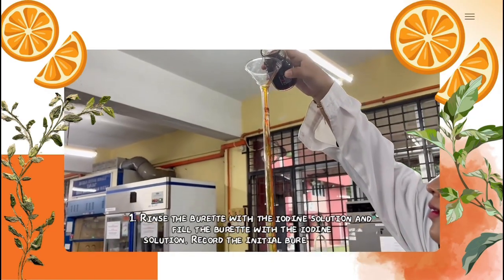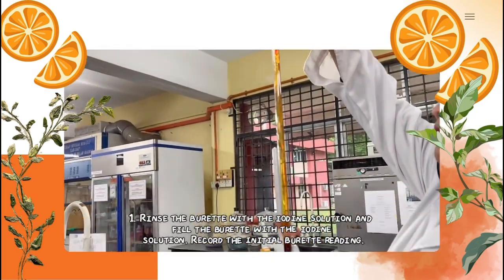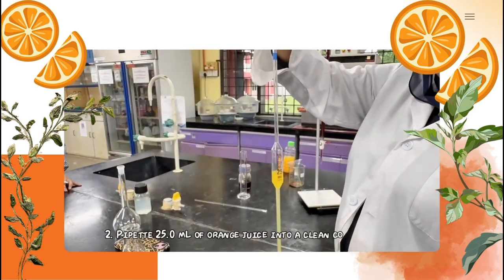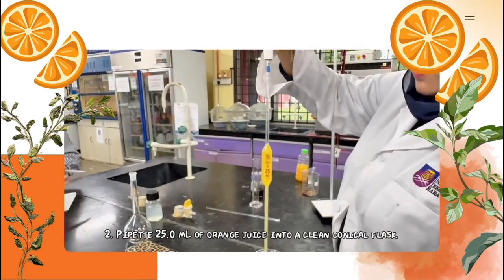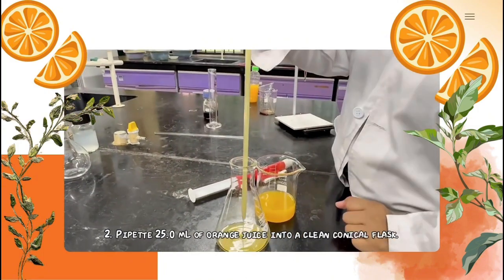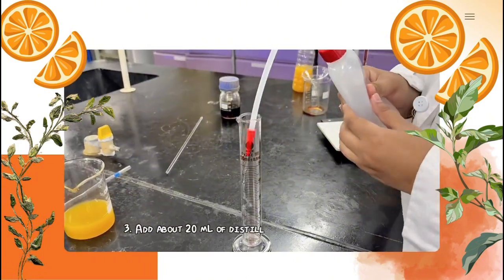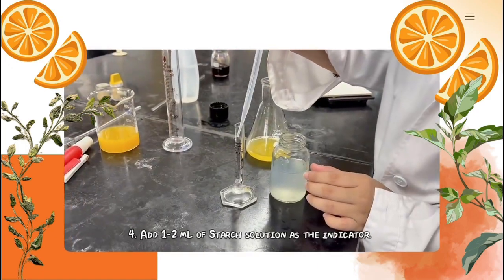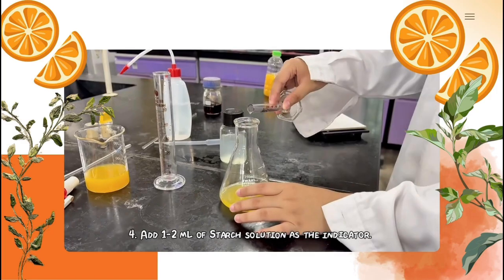Rinse the burette with the iodine solution and fill the burette with the iodine solution. Record the initial burette reading. Prepare 25 ml of orange juice into a clean conical flask. Add about 20 ml of distilled water into the flask. Add 1 or 2 ml of starch solution as the indicator.